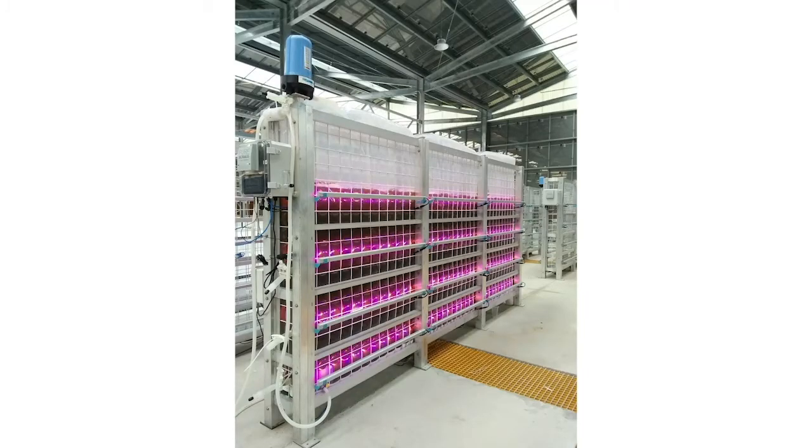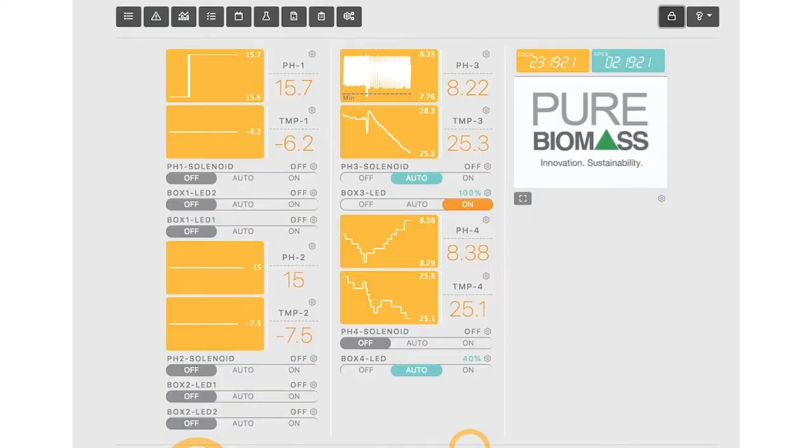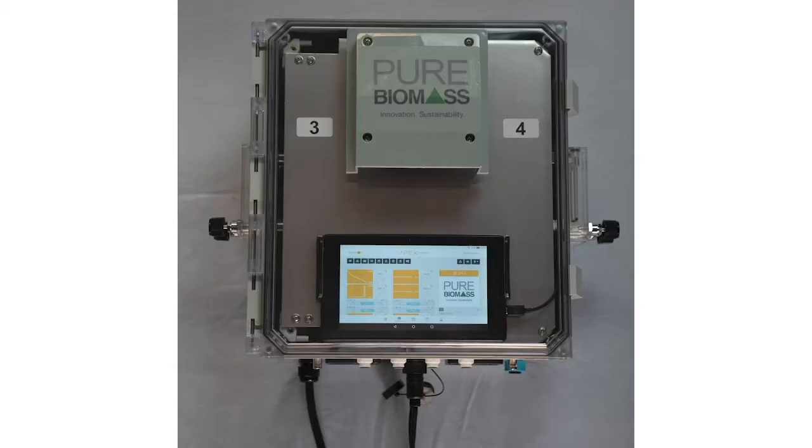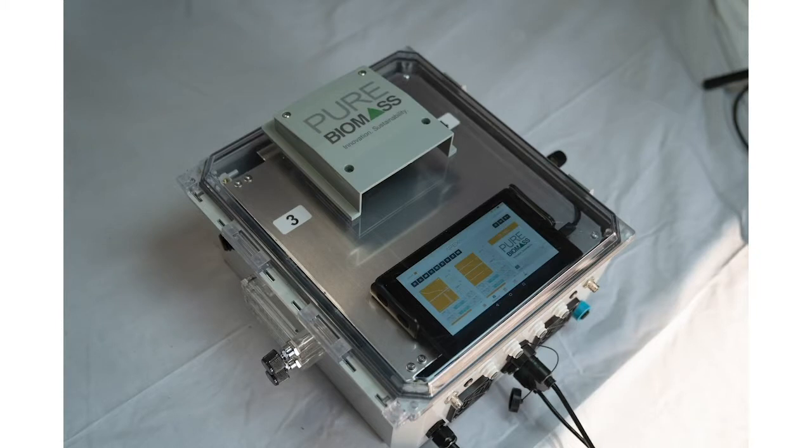All of our systems come with a remote Wi-Fi control system, which allows the operator to maintain a constant pH, monitor and control the temperature, and control the LED intensity and photo period. This system also allows the user to download pH and temperature data for in-house research and development projects. The control system is highly versatile, and additional custom features can be added upon request, such as DO, ORP and nutrient sensors, level sensors, as well as automated pump and valve control.